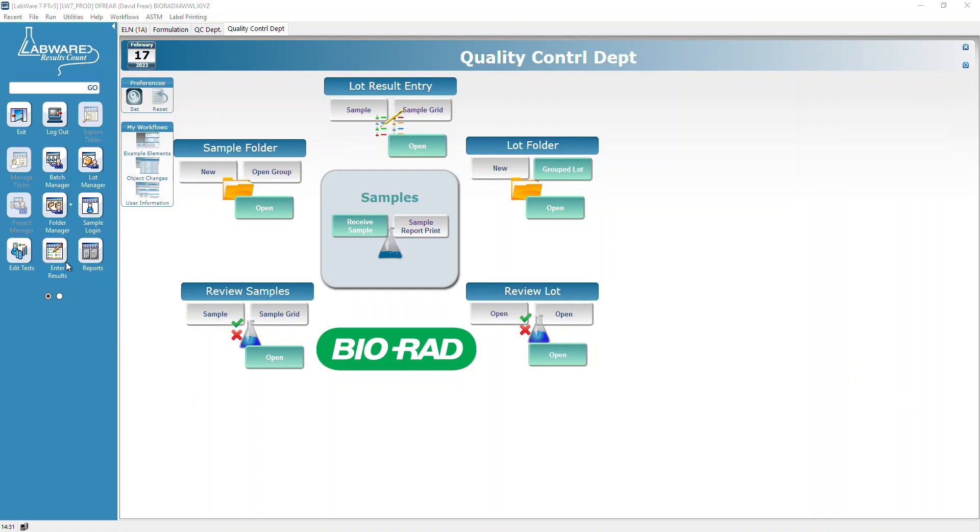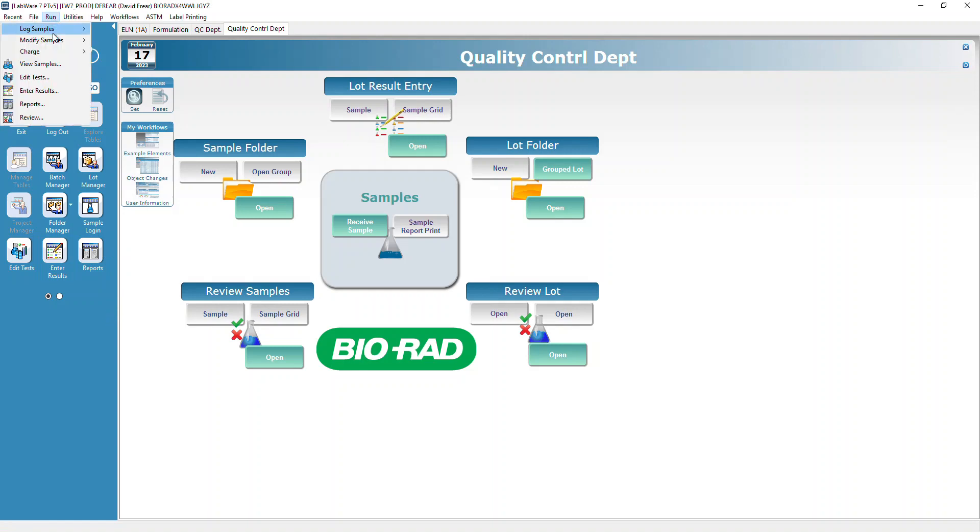To create your P sample records, you need to go to Run, Log Samples, and do a grid login.